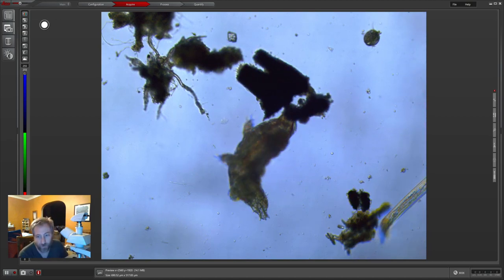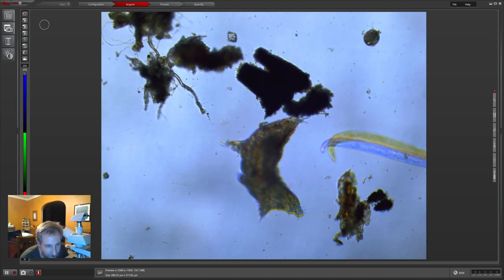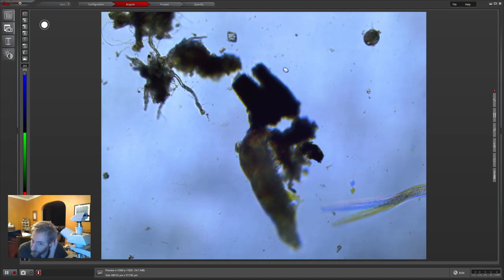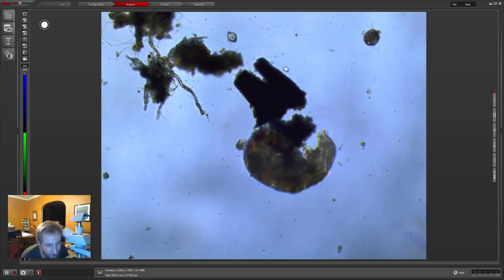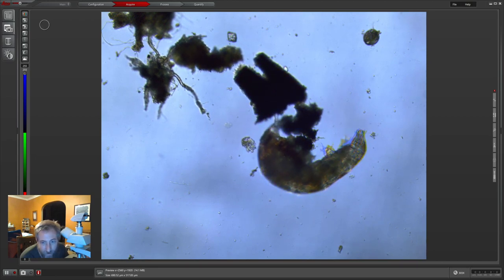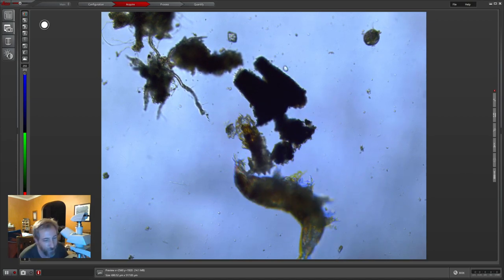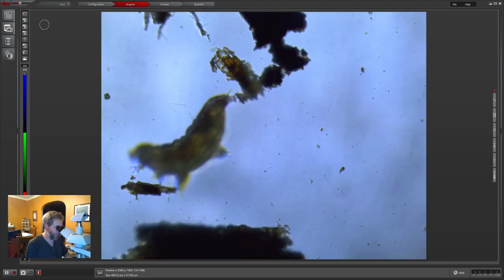The other one that was eating was a little bit smaller than that. I just pulled it out of a sample — no acid, no nothing. The camera I have on my microscope isn't really set up for movement, but it does an okay job of capturing it. The colors get a little dragged out.